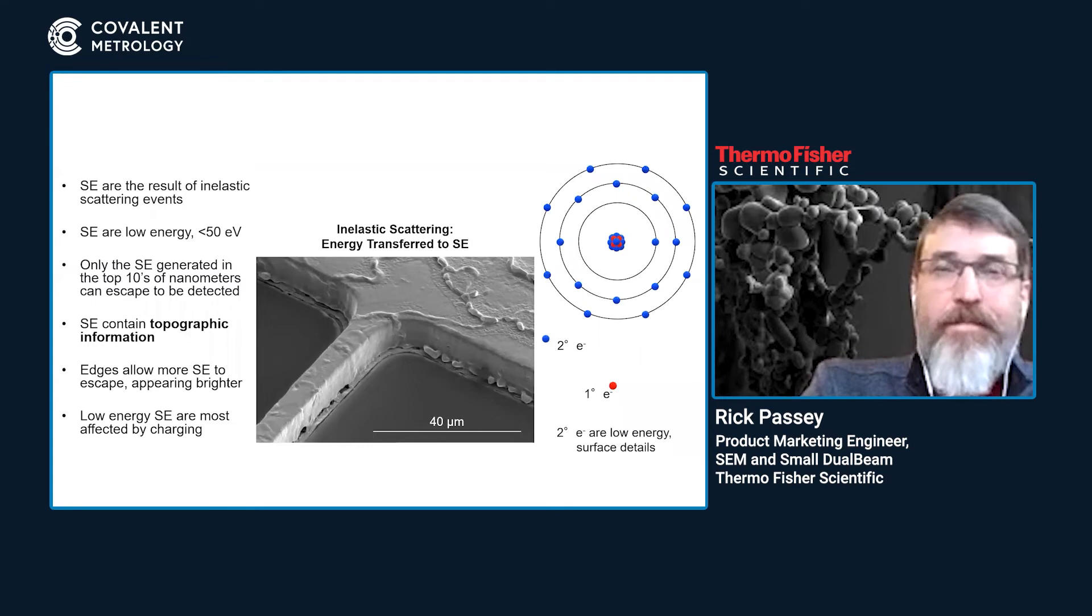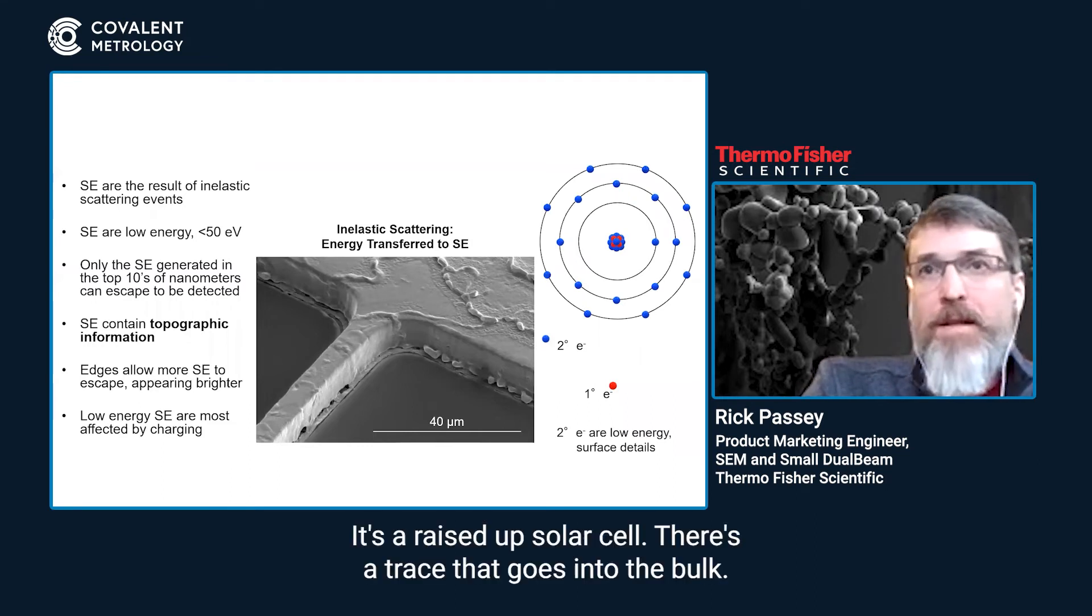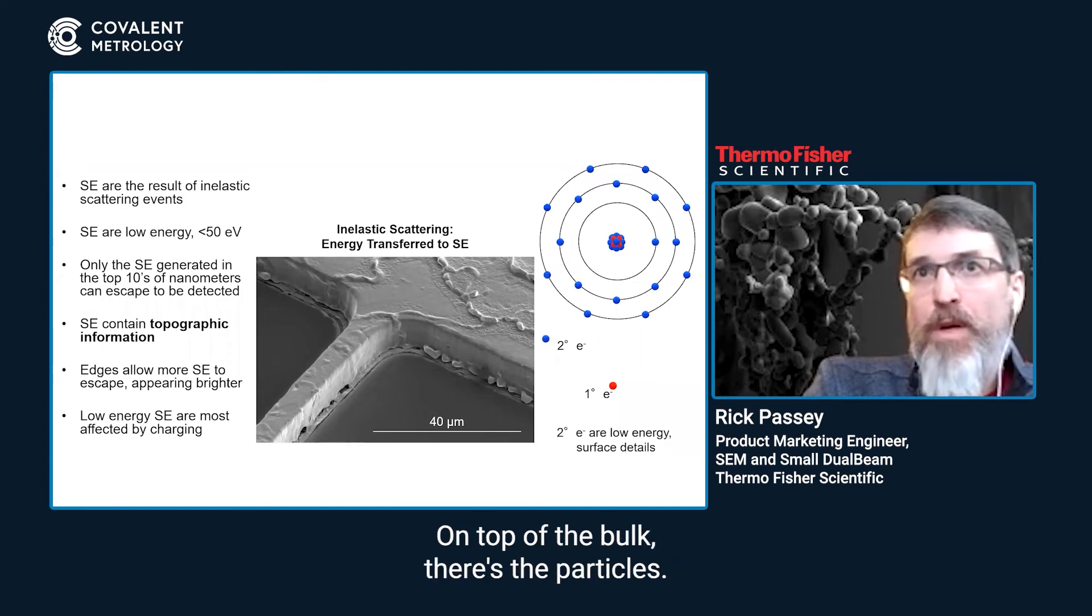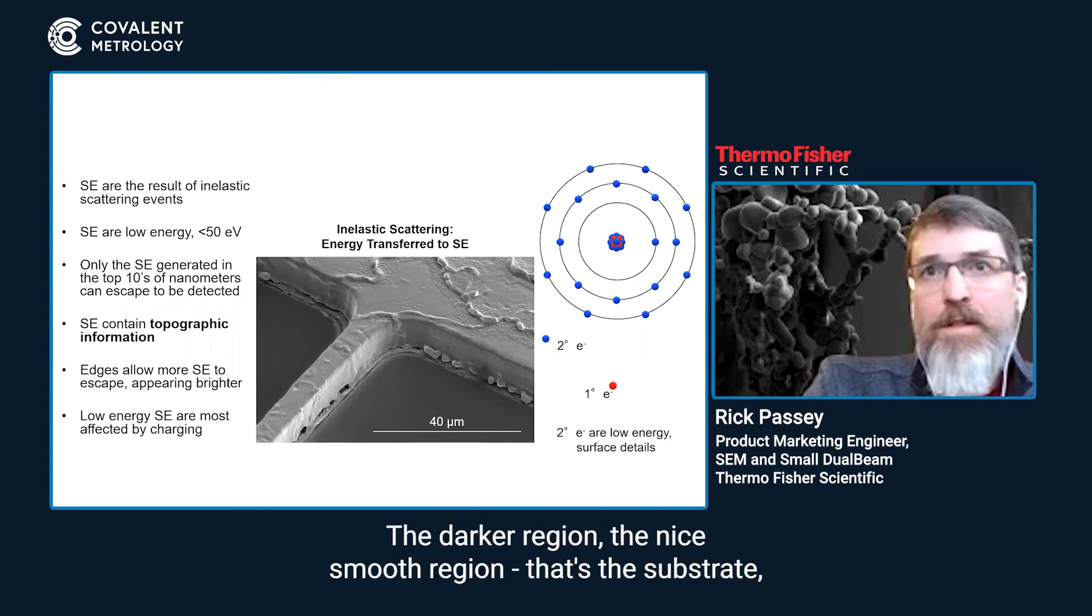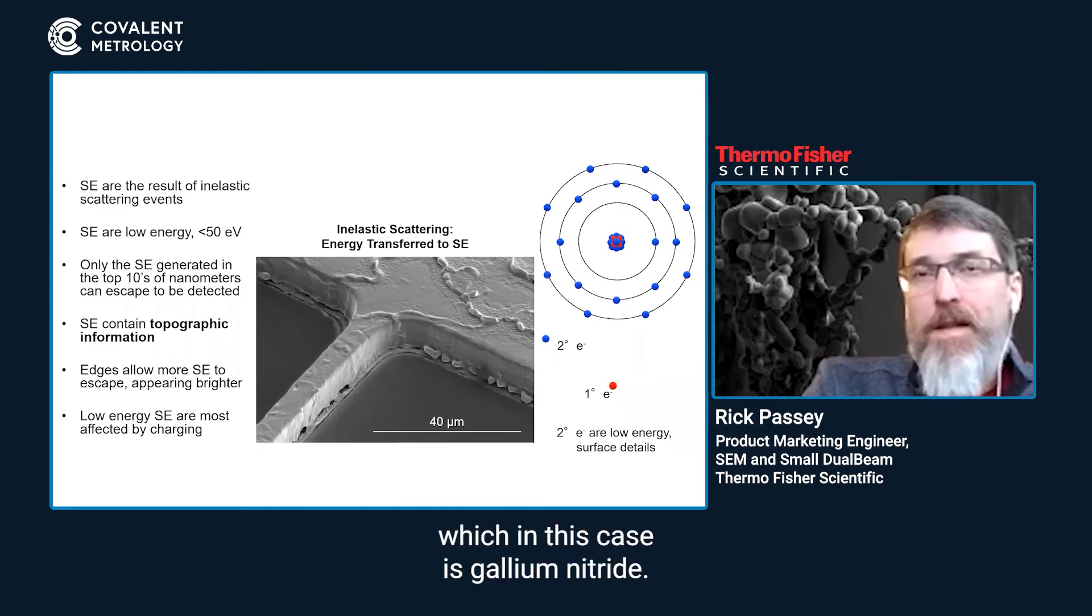It's a raised up solar cell - there's a trace that goes into the bulk. On top of the bulk there's the particles. The darker region, the nice smooth region, that's the substrate, which in this case is gallium nitride.